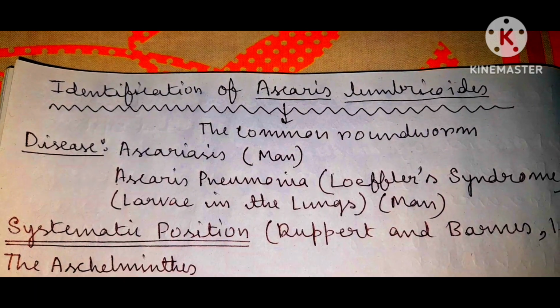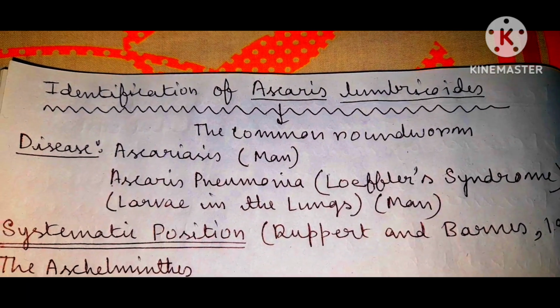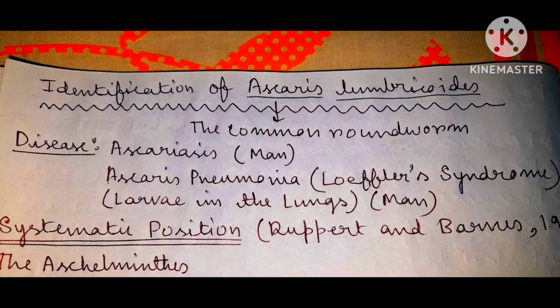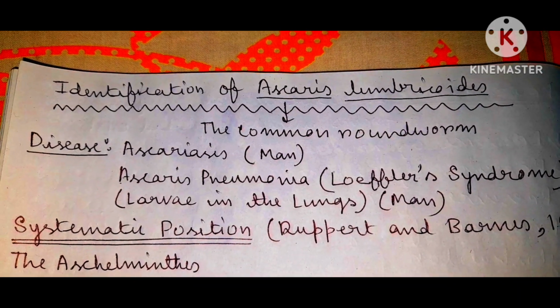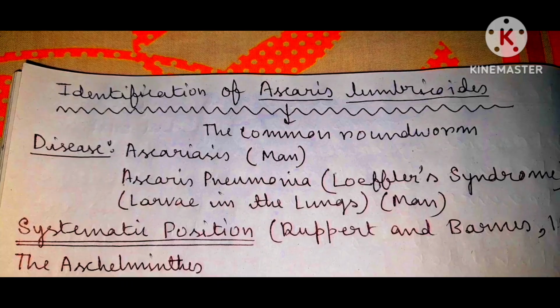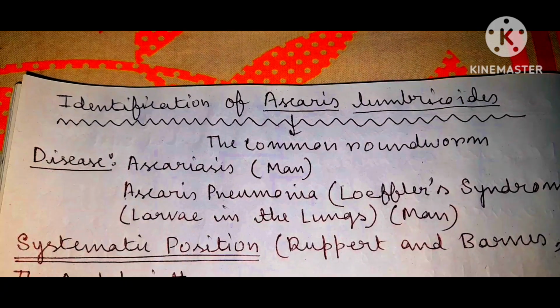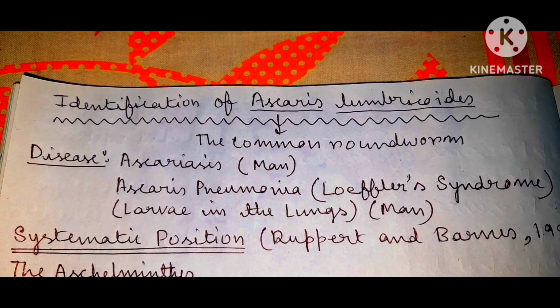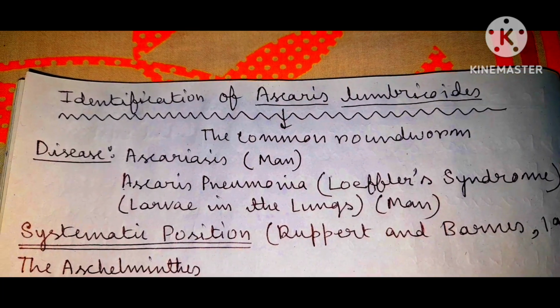Today I am going to discuss with you about identification of Ascaris lumbricoides for your upcoming parasitology practical exam of SEM 4 under CCF of University of Calcutta. Ascaris lumbricoides, the common roundworm.